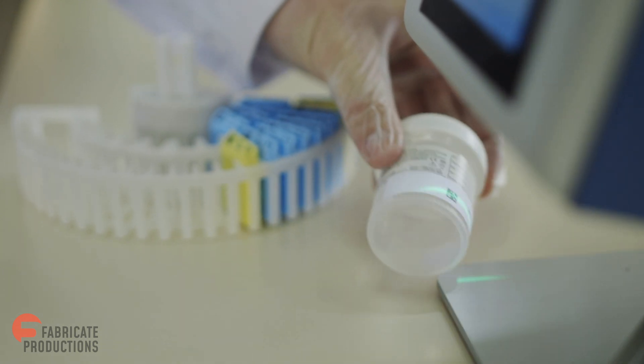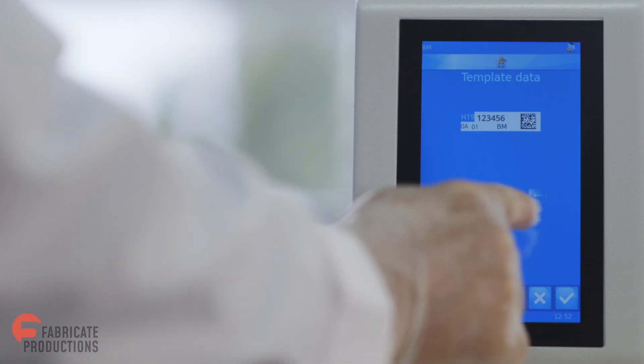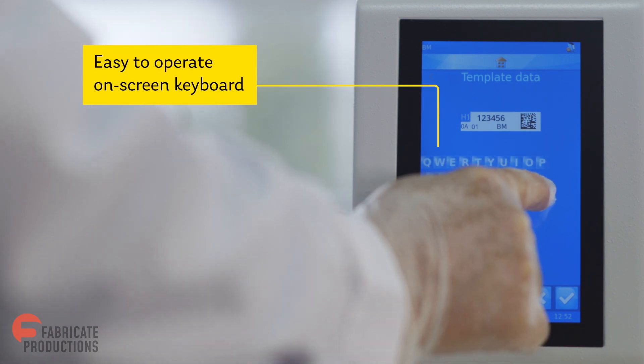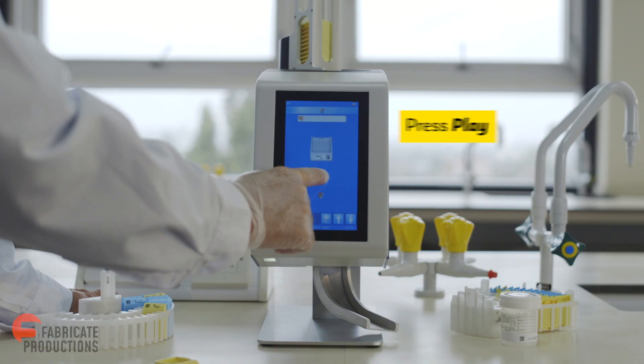Scanning a container or requisition slip automatically transfers the sample ID to the cassette label image. Case information can be typed in using the keyboard or simply by pressing play.